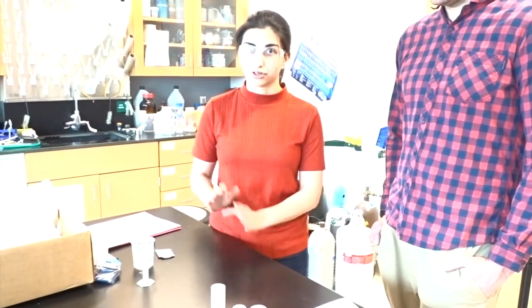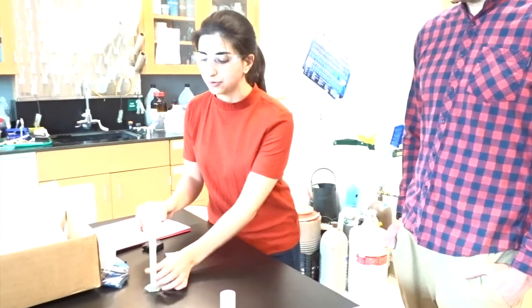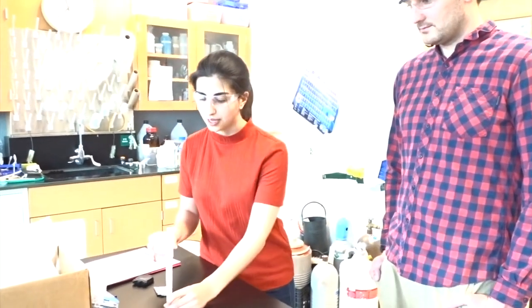So for this activity, the students will get a fourth of an Alka-Seltzer tablet. One will be solid for the reaction and one will be crushed. For the first part of the experiment, we'll do the solid Alka-Seltzer tablet. The students will need to measure out 10 milliliters of water before starting. And they will be given a 10 milliliter graduated cylinder to measure this out. And you can use any cup or beaker available to you to give the students the water that they will then measure out.